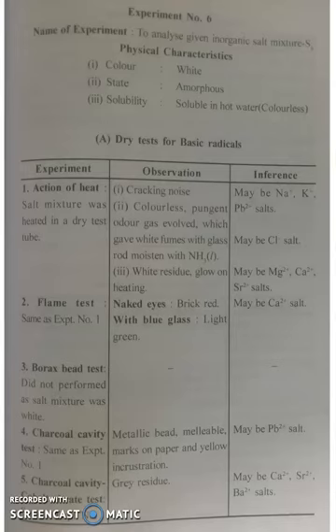Then wet test for acid radicals. And then wet test for basic radicals. Then you do analysis of group 1 and go on to group 2, 3, 4 like this. And then analysis of group 5.